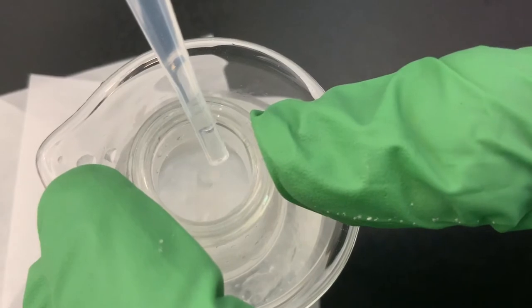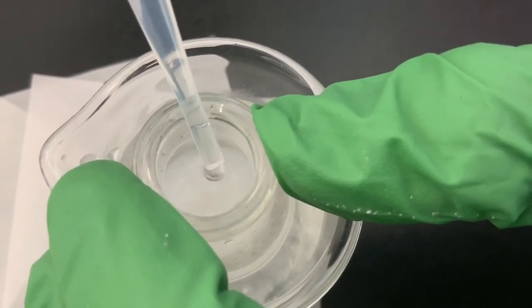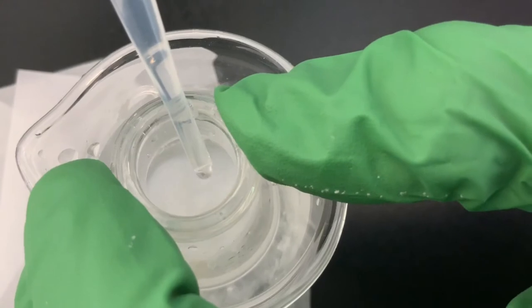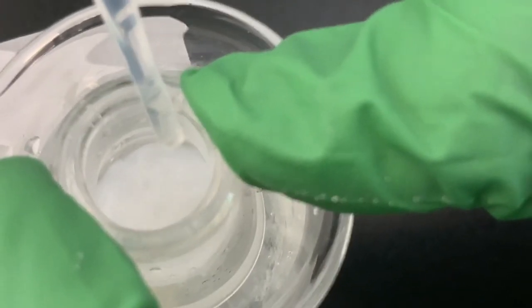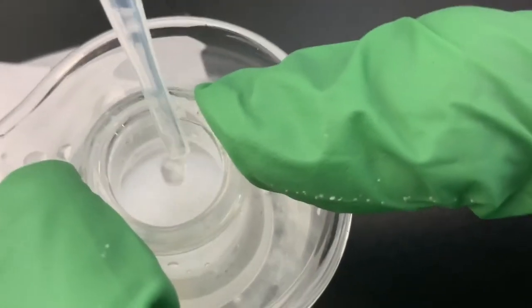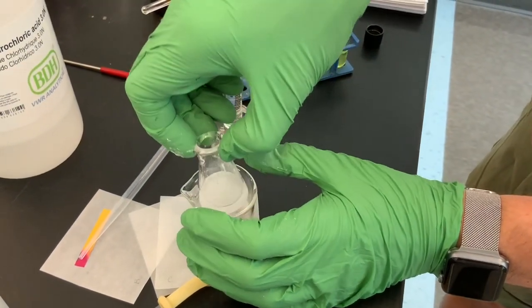Because the benzocaine itself is not water soluble. So what we're doing is we're deprotonating the hydrochloride salt of benzocaine, protonated benzocaine, of course. And so this process is called freebasing. And what we're getting back then is going to be our freebase amine. So now you can really see that we've got a lot of material coming out. So I've added 2 milliliters, and let's go ahead and take it out of the flask just so we can see how much we've got. We'll look at it edge on, and look, we've precipitated that solid now.